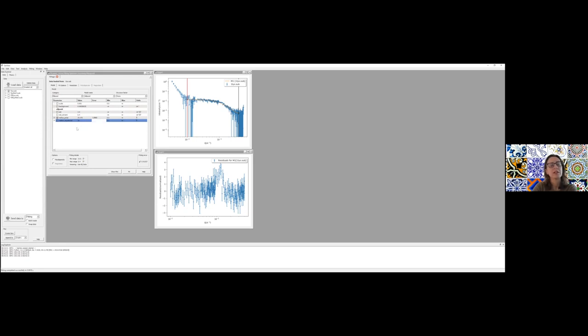an ellipsoid ratio, or in other words, the polar to equatorial ratio, to be too large, because I know that the structure should not have a polar radius that is so much larger than the equatorial radius. So what the step-by-step guide also tells you is that you should try to increase the equatorial radius, which I haven't fitted yet, to a slightly higher value, and try to fit again, just to decrease this ratio a little bit, because it's not realistic given what we know about the structure. So let's fit that again and see what happens.